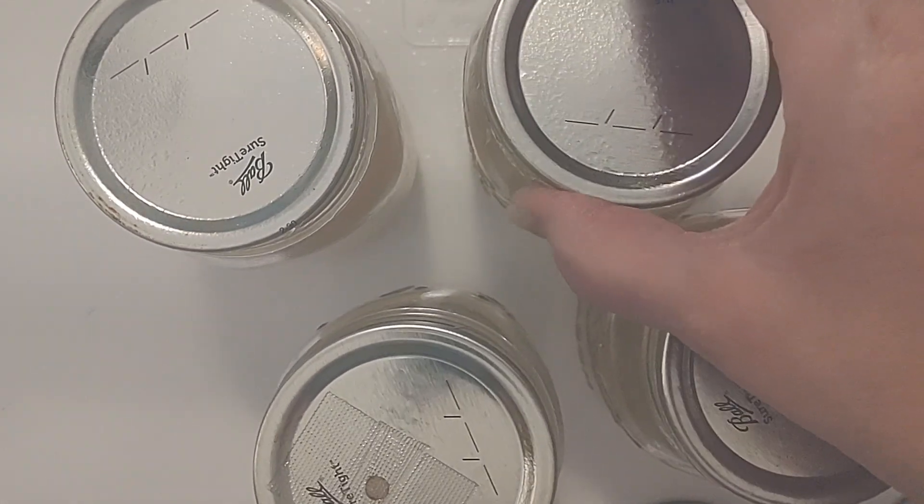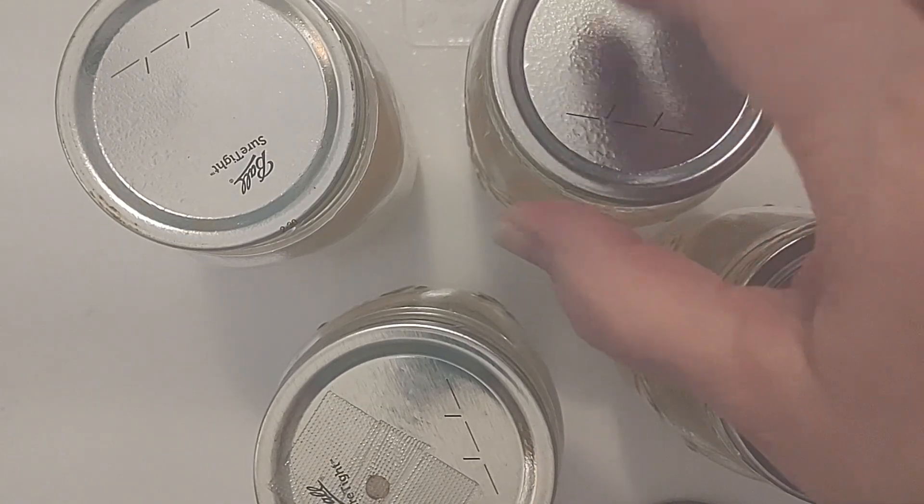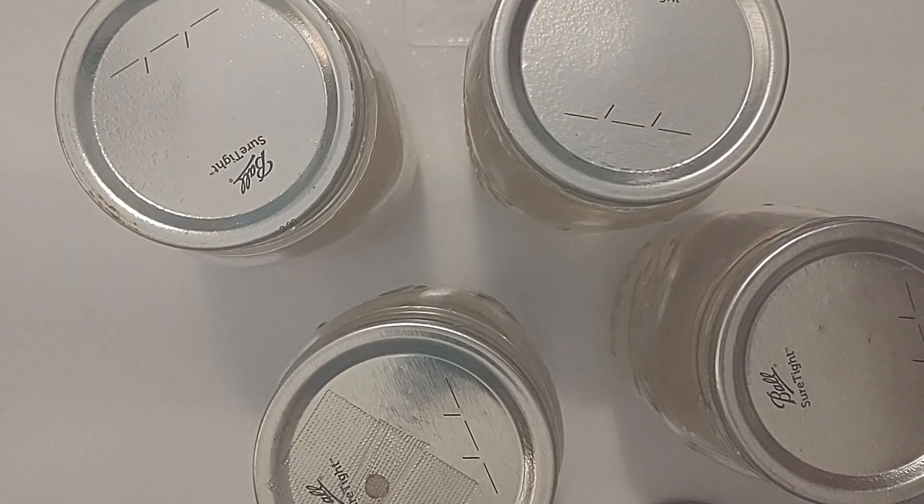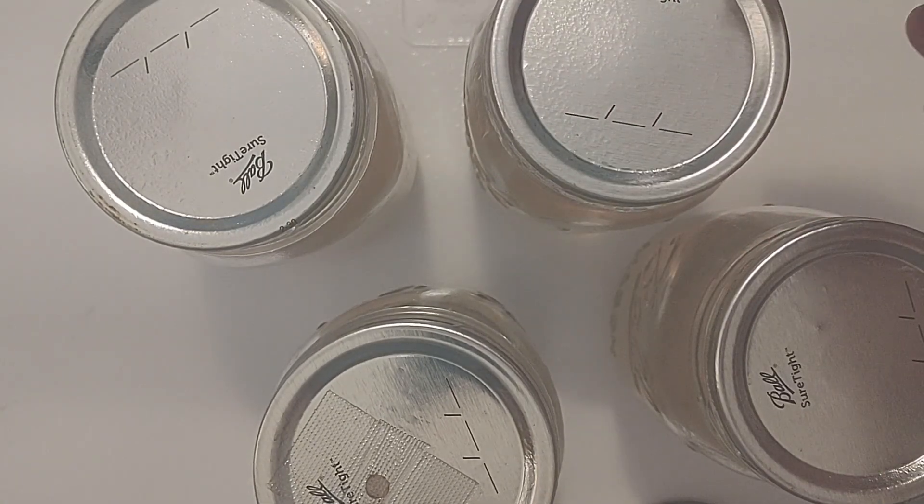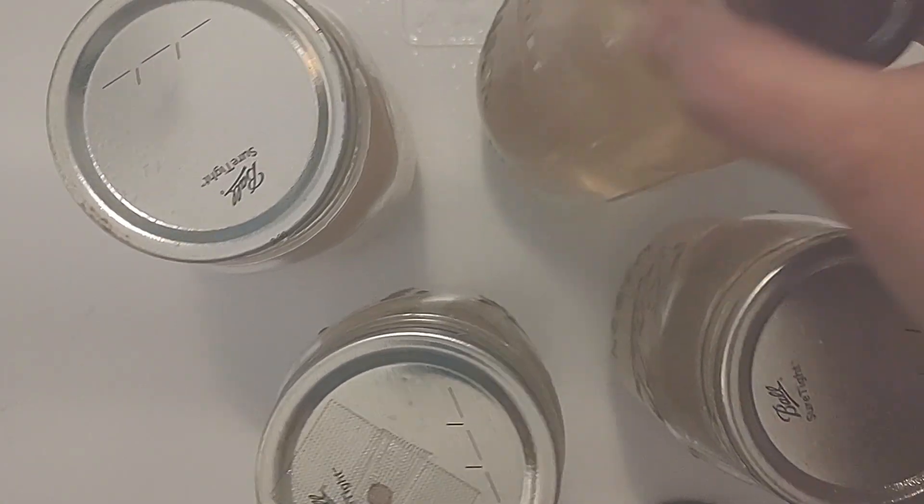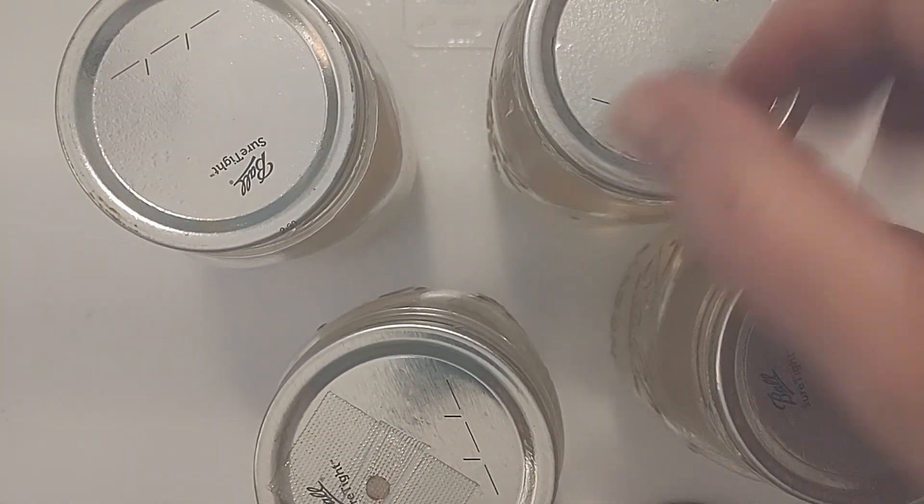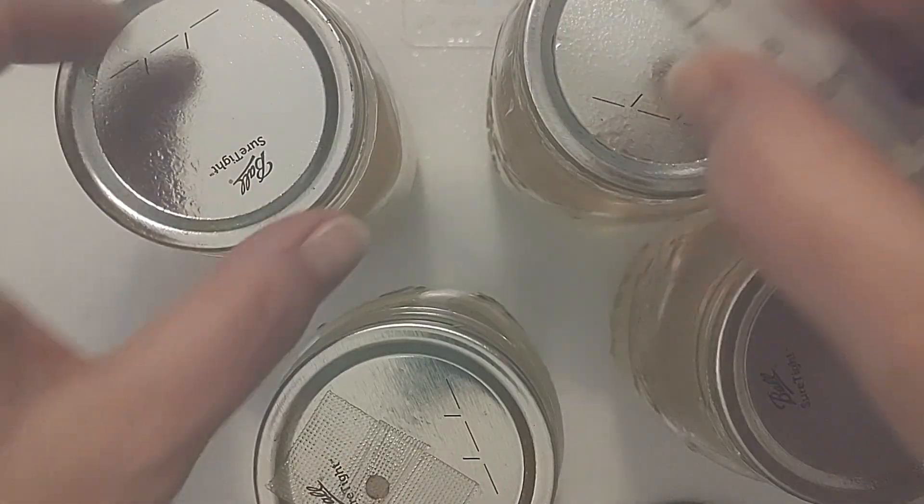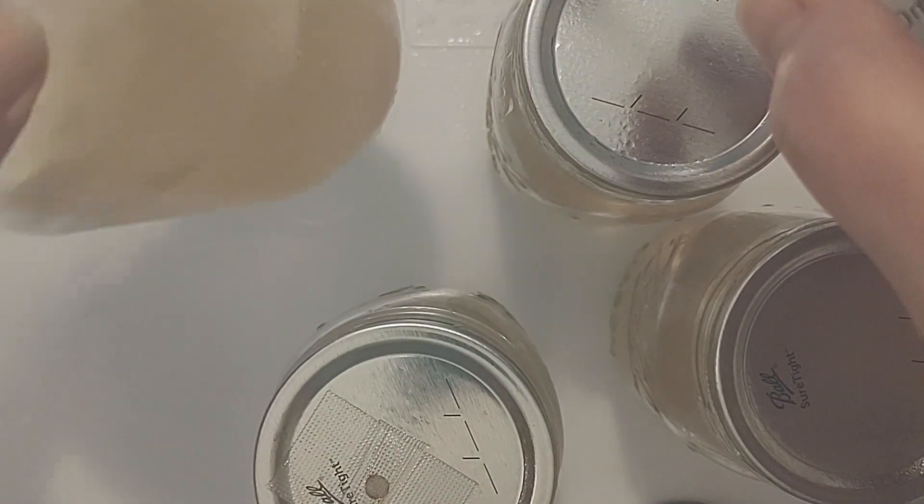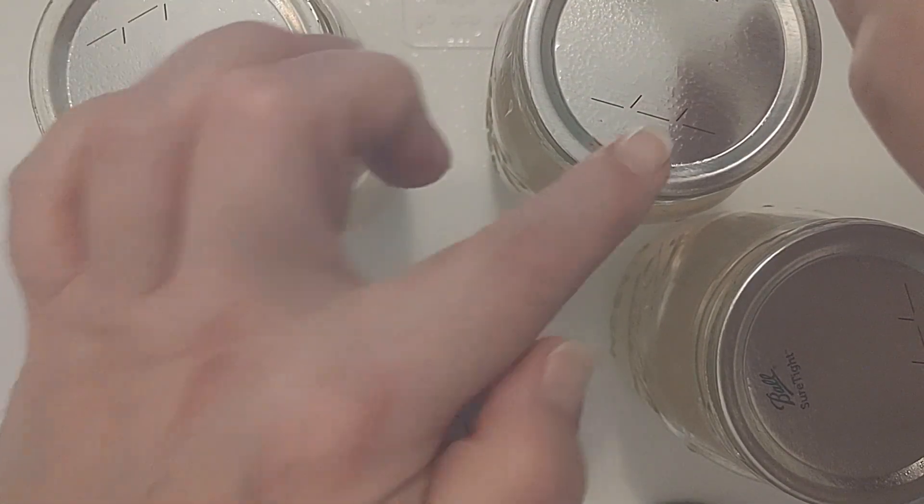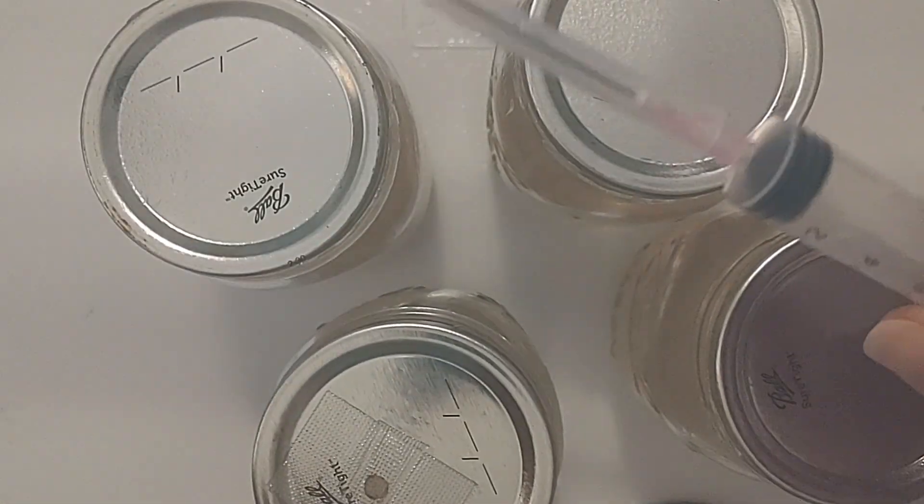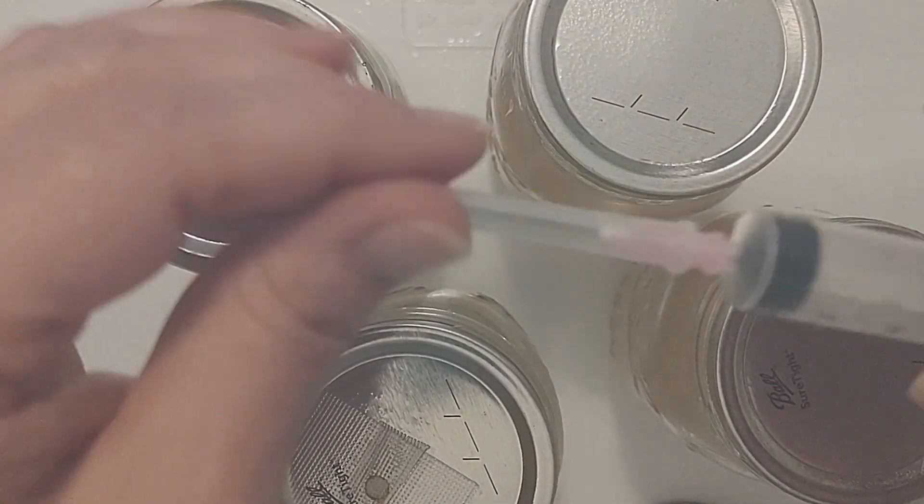It is basically liquid nutrients for our liquid culture. So we're going to be taking a syringe of this beautiful liquid culture here and create another one, and I'm going to show you that really quick.